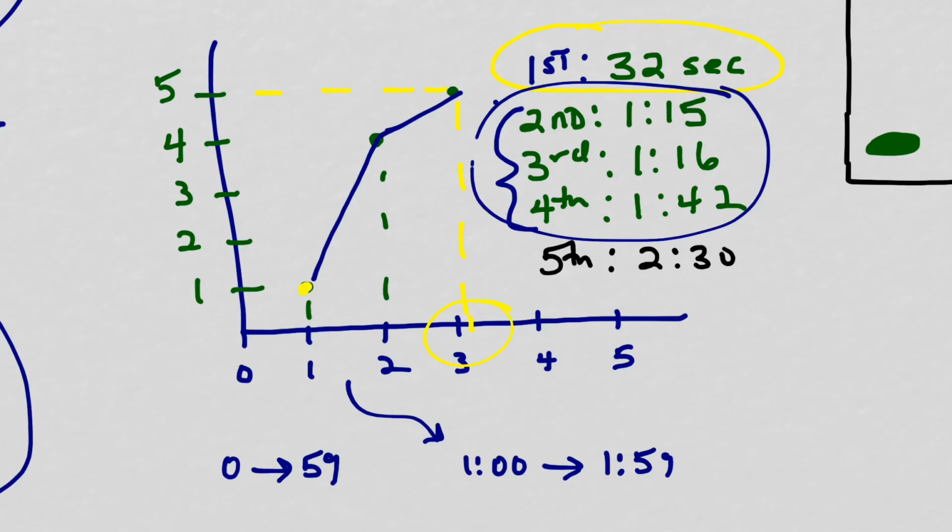And that time, let's say it's 3.2. So we get 3.2. Now 0.2 is not a second, so we're going to take 20% of 60 seconds. Remember, there are 60 seconds in between, so you might want to think about what that is. If I'm guesstimating this is 0.2, what's 20% of 60? You can do that math to find those seconds. But that value for time, once we evaluate to 60, is going to equal the estimated time of 50% of your disks rising. So the ET50, estimated time for 50% of your disks rising.